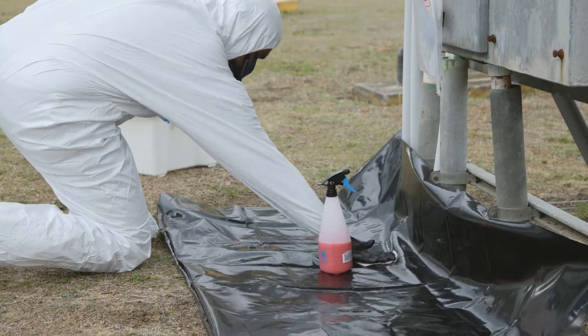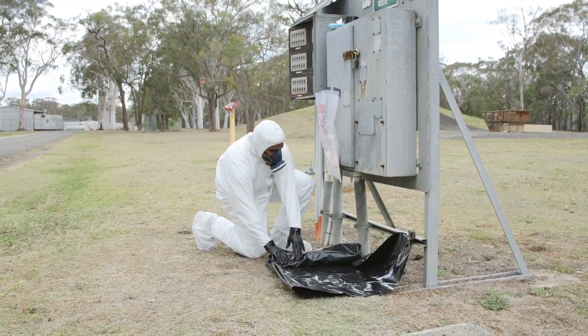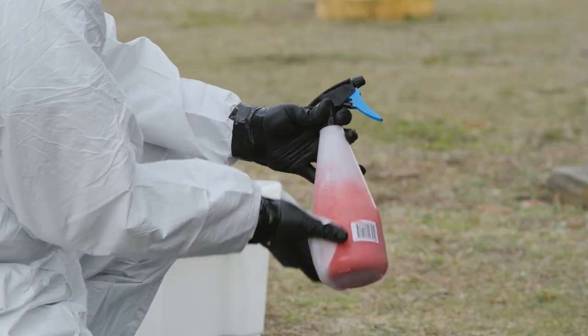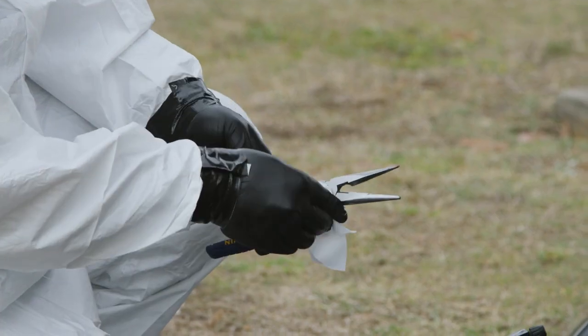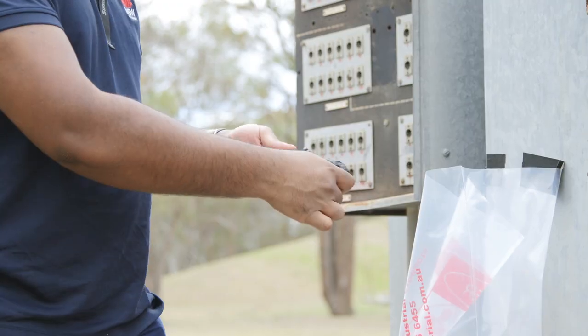Using wet wipes, wipe up any remaining debris. Fold up the plastic sheeting, ensuring any debris is contained, and dispose of it safely. Wipe your hand tools and decontaminate before placing all used plastic, PPE and wet wipes into a waste bag.